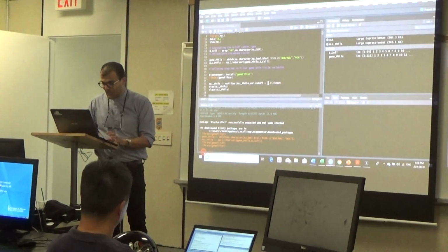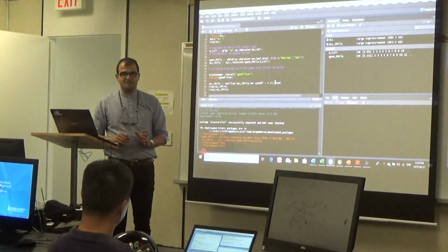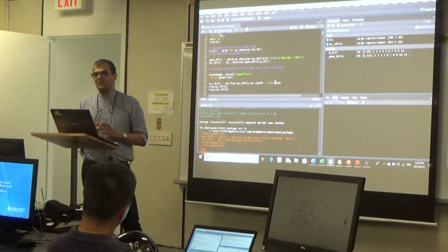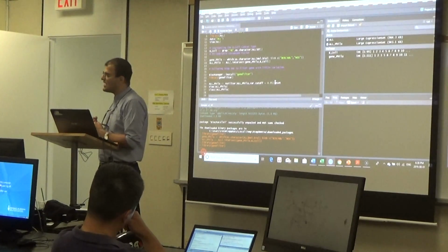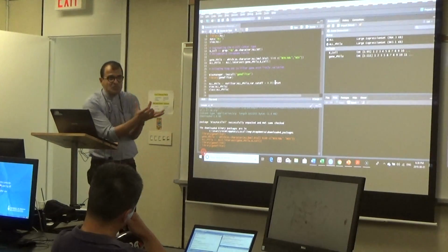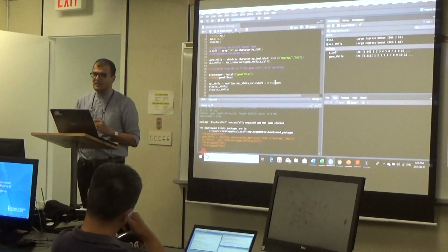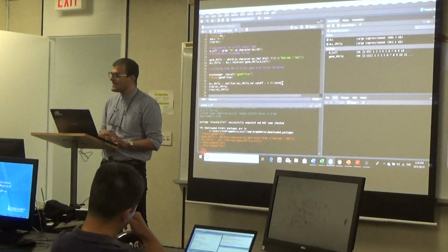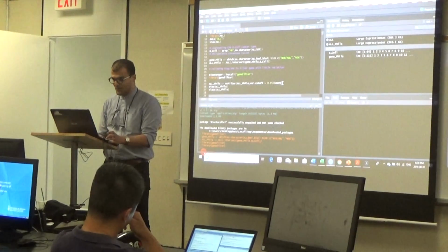And also if you see, I have $E set. It's always crucial as a template for you for machine learning. By doing that, you are only extracting the gene expression profiles. Because what is the plan? From the gene expression profiles, you are going to find the type of the cancer in machine learning. That's why you have $E set. Then filters your gene expression profiles.